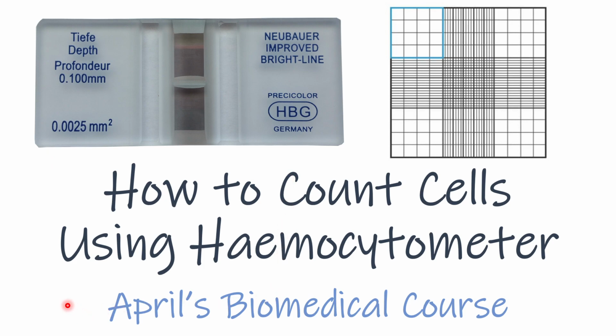Hello and welcome again to April's biomedical course. Today we are going to learn how to count cells using the haemocytometer, or if you would prefer, the Neubauer chamber.